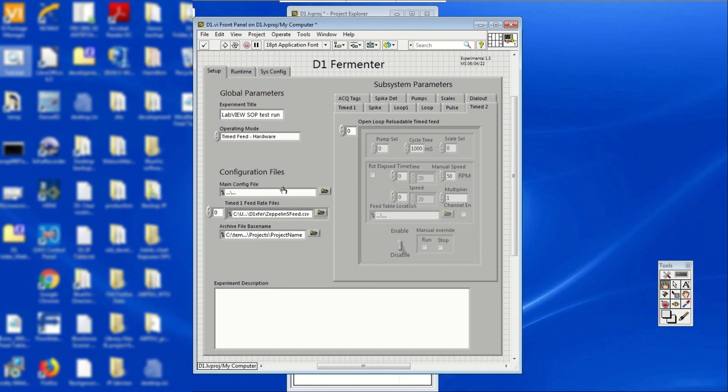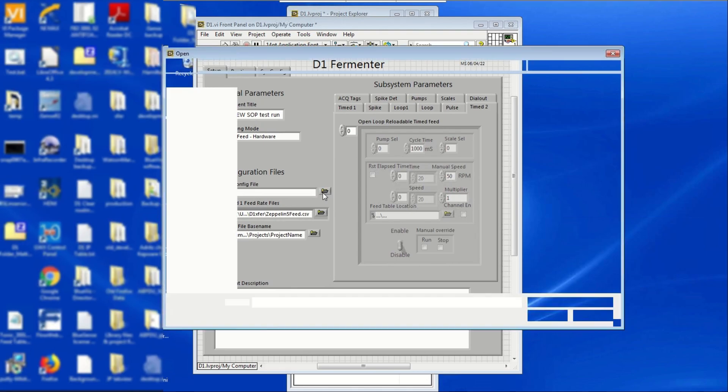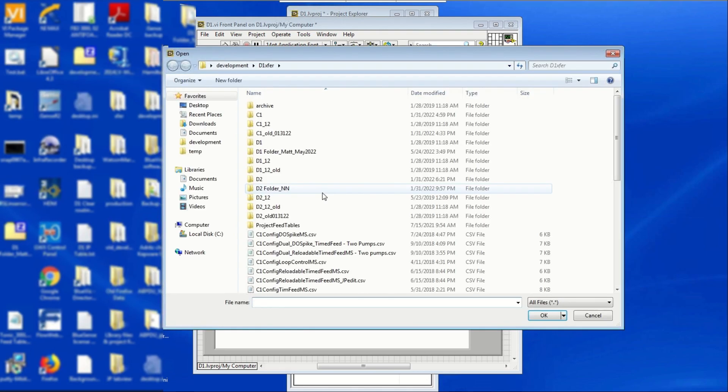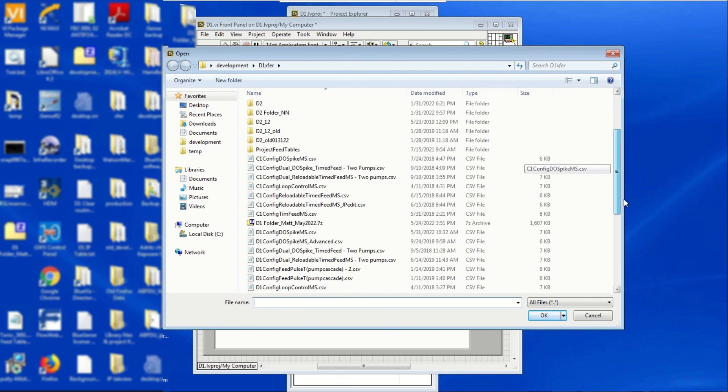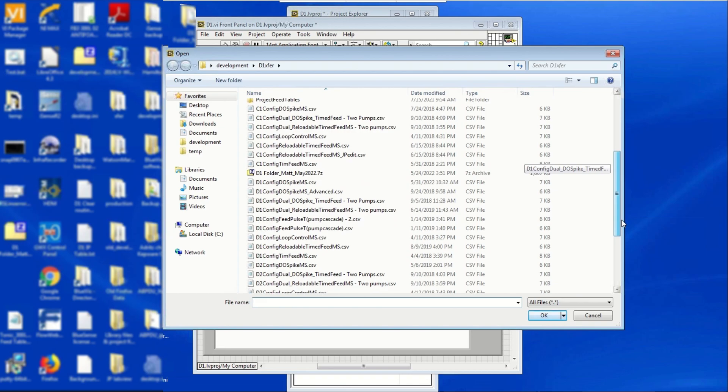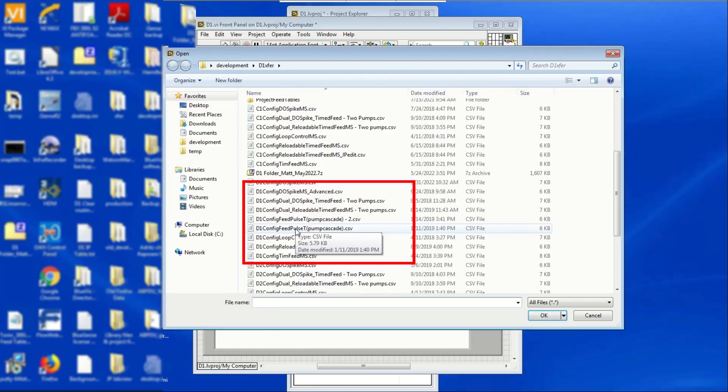Under the configuration files in the front panel, click on the yellow folder icon next to the main config file bar. Main configuration have the feeding strategies files that can be used depending on your project's needs. From the file list, choose a .csv feeding strategy file and double-click on it.